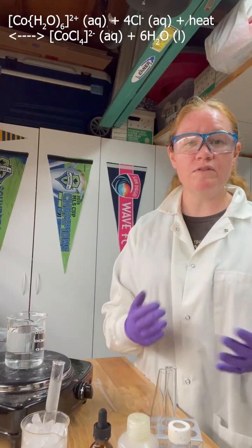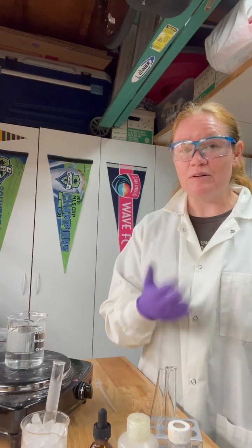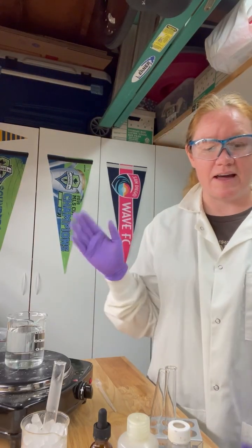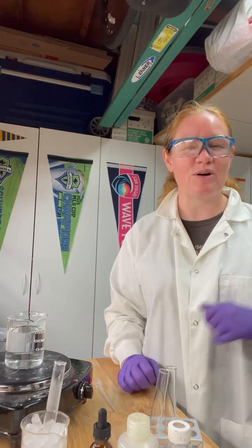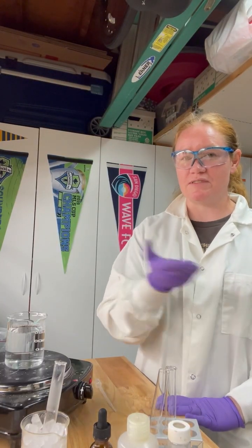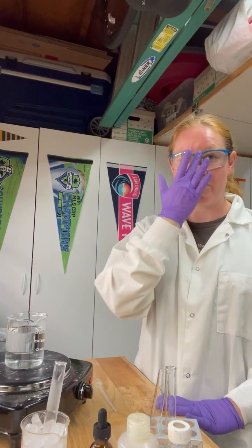Okay, so hopefully you're seeing what happens with our Le Chatelier's principle as we perturb our system back and forth. When we started off, we had a nice pink color, and then we flooded our system with one of our reactants, the chloride ion. And so in order to use some of those chloride ions, our system had to react to that stress and produce more product, that tetrachlorocobaltate 2 ion. The chloro is chlorine in there, okay? So we shifted it and we got that blue. We did see formation of product.